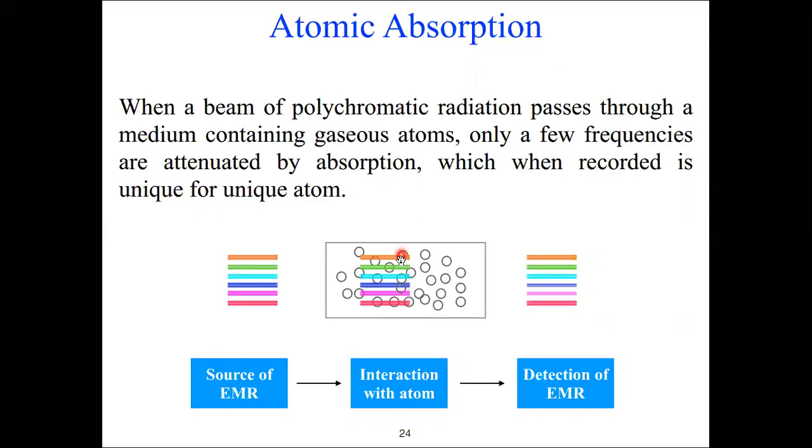So the electromagnetic radiation with that wavelength will get reduced, or attenuated. The amount of that radiation decreases, and only some of it will reach here.